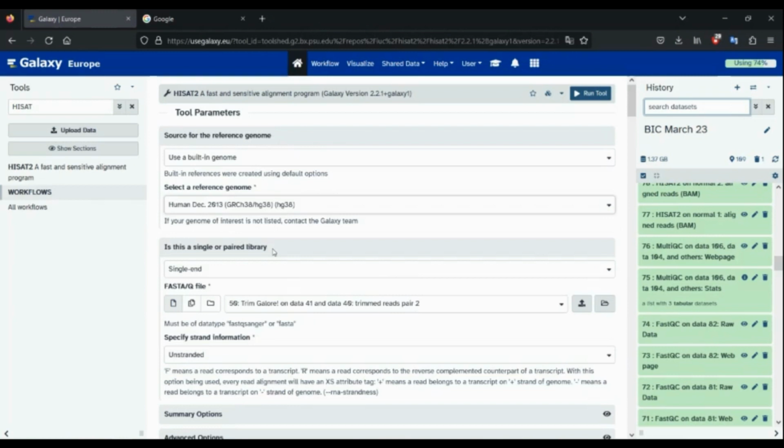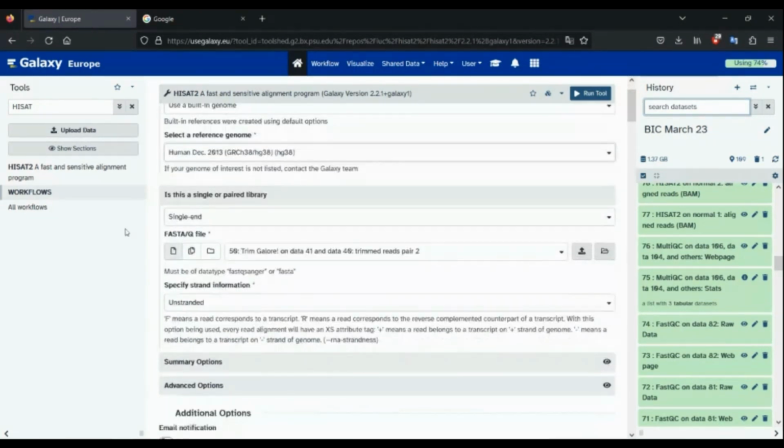It's always a good option to use the latest ones, because the previous version happened to be HG19. Now, HG19 and HG38, there's a difference because, of course, both are human genomes. It's basically the same thing, but it's actually quite different, because if you try to load an HG38 aligned output and view it where the reference genome is HG19, you will see that the genes that are supposed to be there on HG38 are in the wrong location in HG19. So this is something you want to completely avoid. Whenever you want to work with any sort of alignment, it's always good practice to use the latest build of the genome available, irrespective of whatever paper you're reading. They may report that they're using an older version of the genome, but like I said, it's good practice to use the latest version.